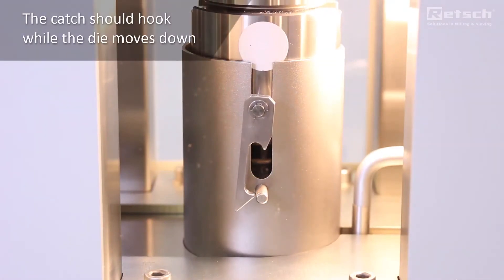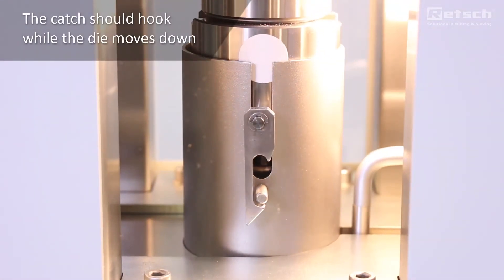The catch should hook while pressing. This is required for the pressing out step.